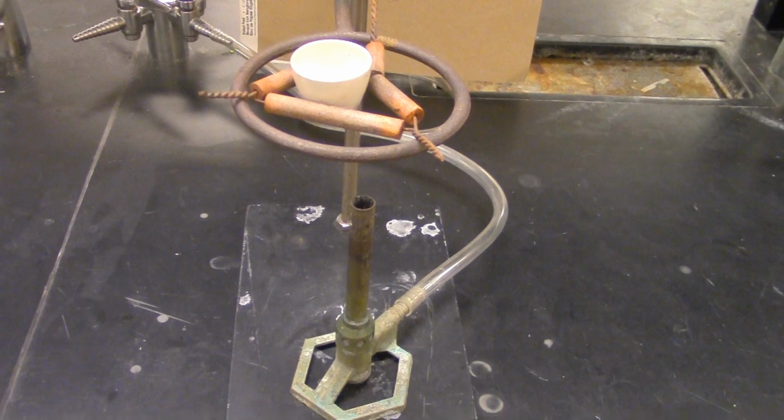You'll use the values that you measure in lab to calculate the mass percent of water, and then with information that's given to you in the lab manual, you should be able to determine which in a list of compounds is your unknown compound, your unknown hydrate.